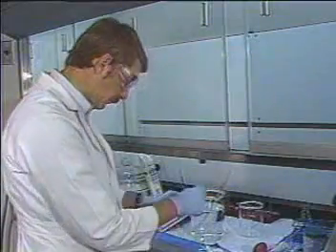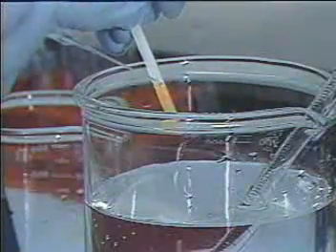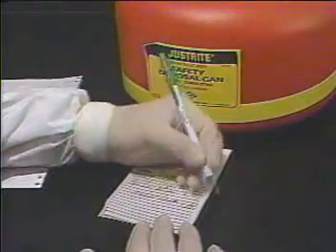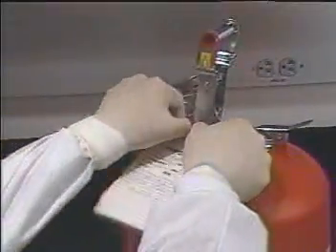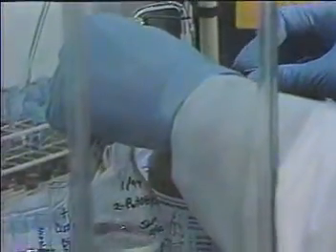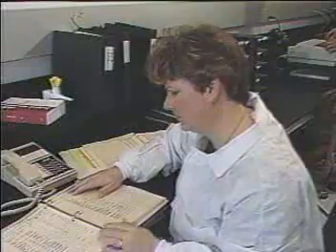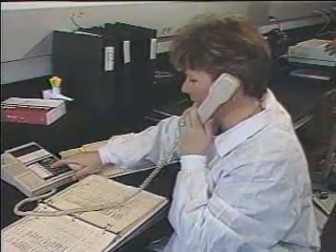Flammables should be diluted so they do not pose a fire hazard. Simple reactions inside pipes can cause explosions. Waste containers for pickup should be properly labeled and placed in a separate area. You can also try recycling your chemicals. You must ask your supervisor if you have any questions, because you are ultimately responsible for making proper disposal arrangements.